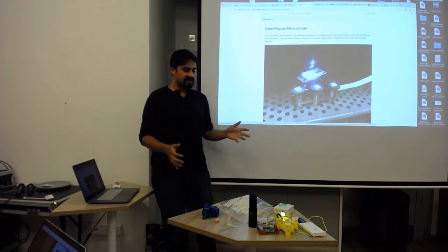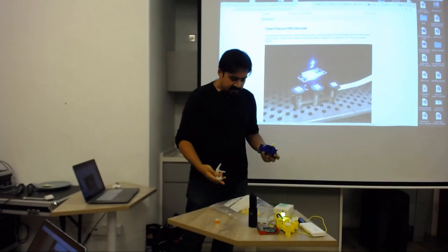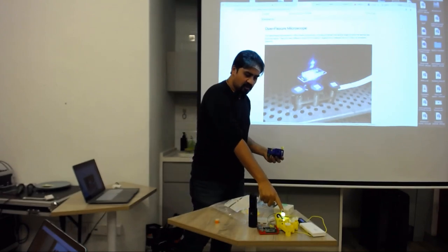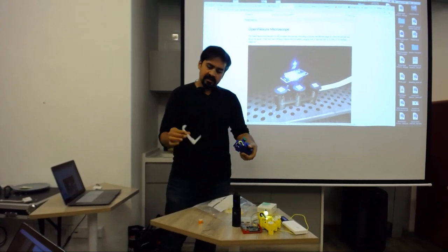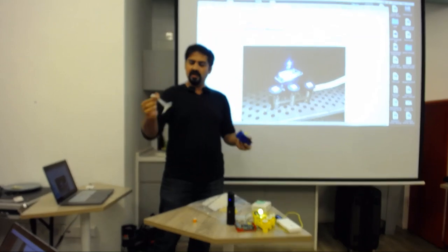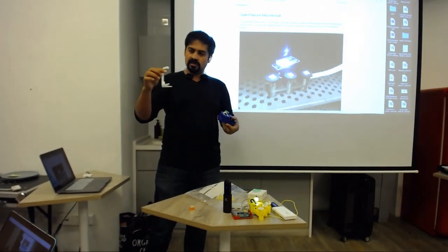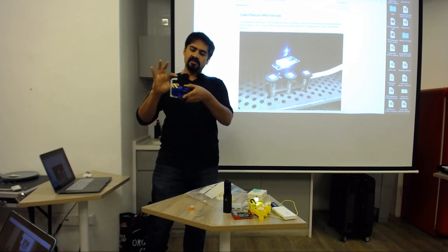Because it's open sourced, you can change the design. For example, here what I've done is I didn't like the fact that the light was so close to the specimen in this yellow thing. So there is a design or a version, sort of a branch on the GitHub, where there's a longer leg. And you can just stick this in here, like that. And now the distance is greater.